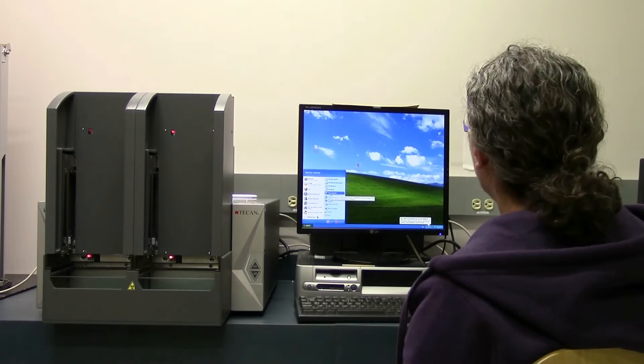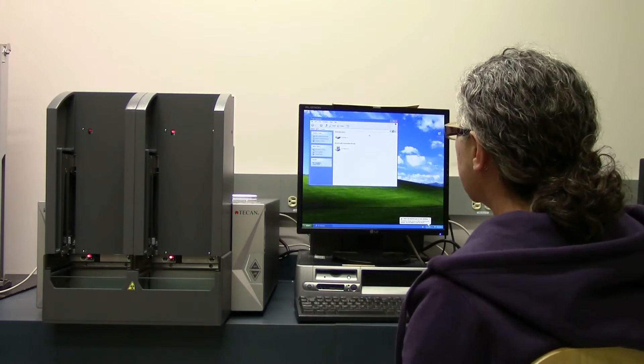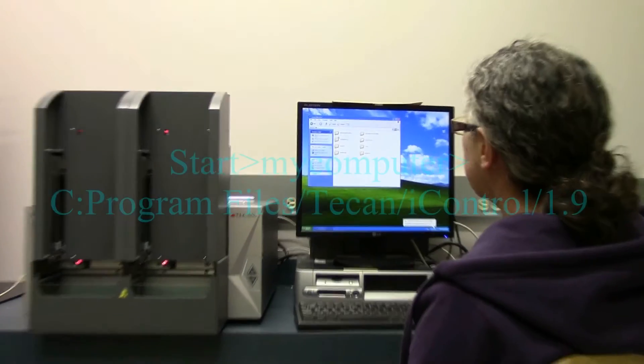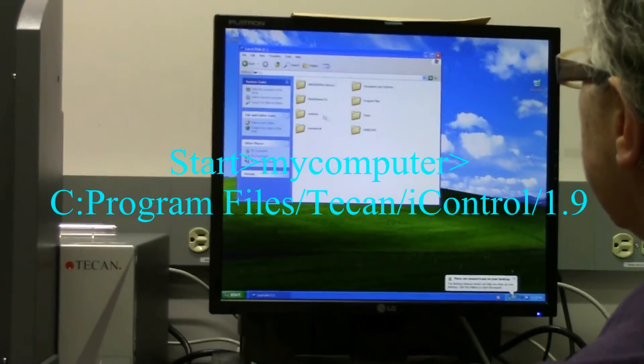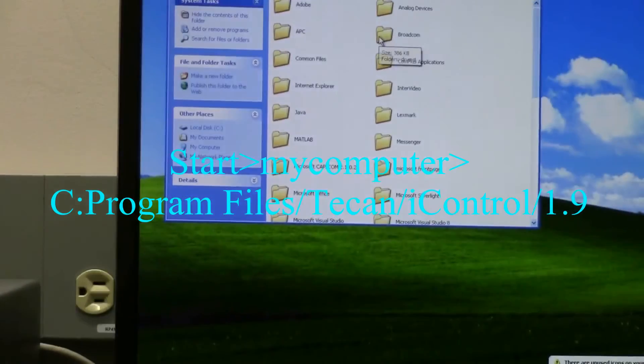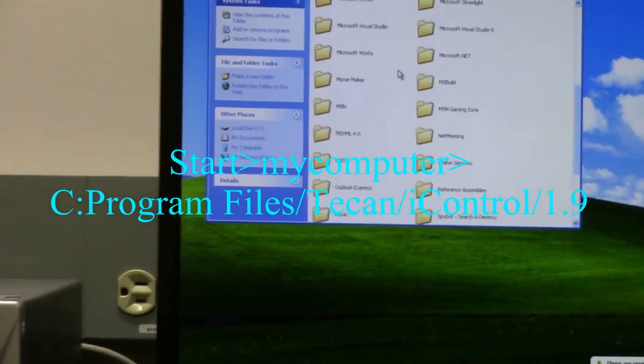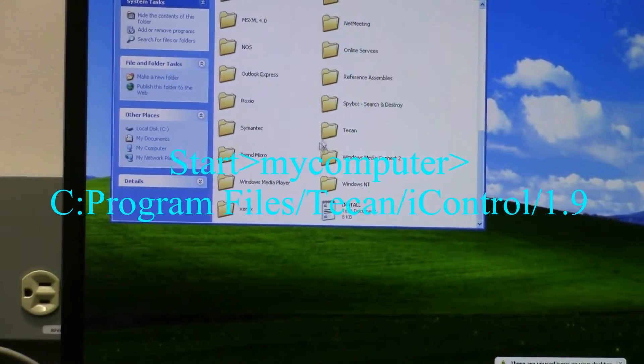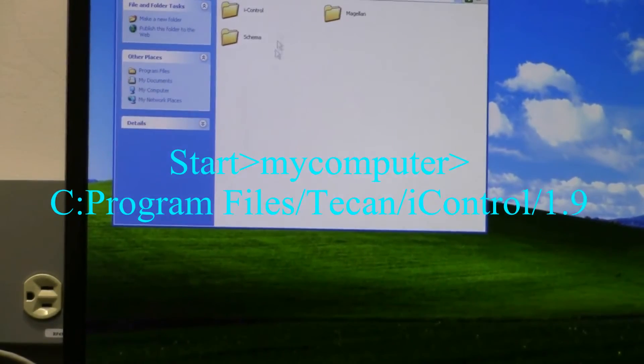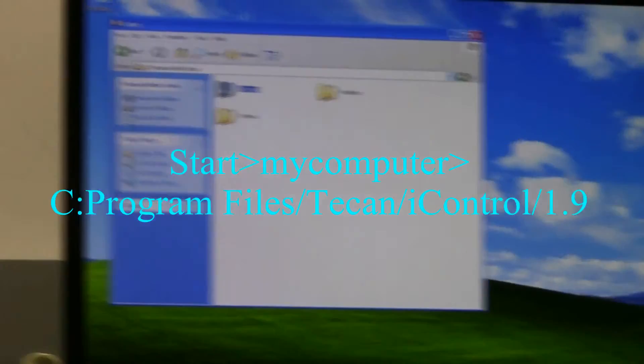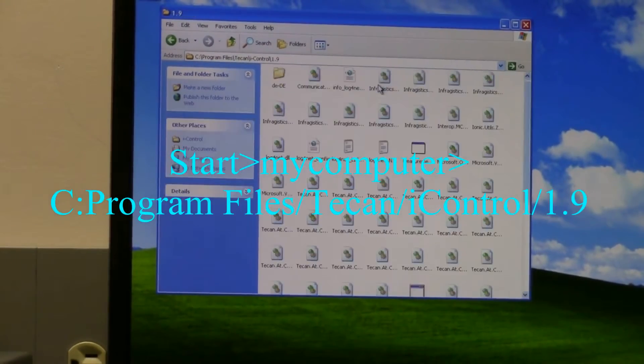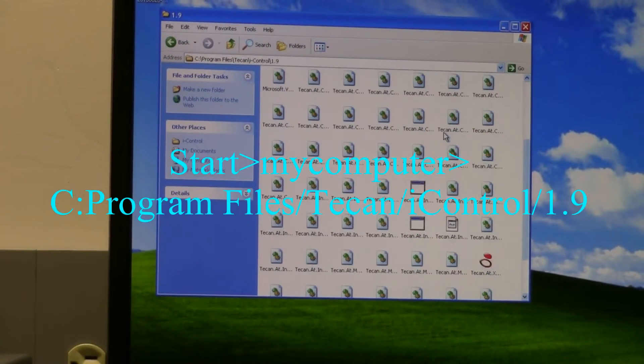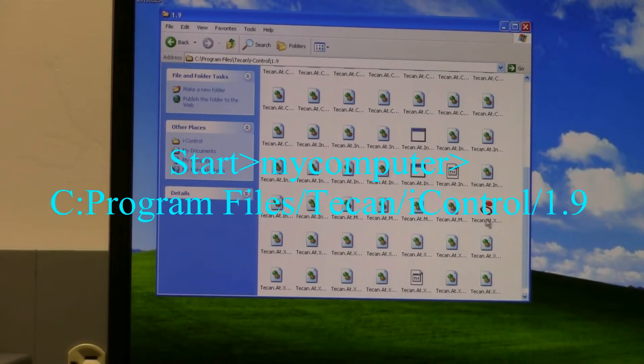Go to My Computer, go to the C drive, Program Files, and then to the Tecan folder. Scroll down to the Tecan folder, open the folder, go into the iControl folder, open the 1.9 folder, and scroll down until you find the actual icon. It looks like this - it's this red thing.